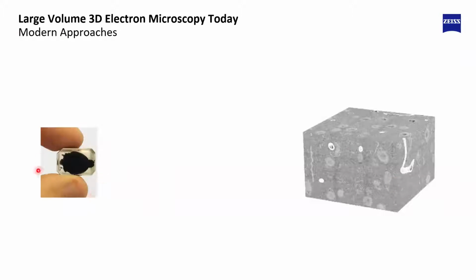What we see on the left is a heavy metal stained brain. That is actually a mouse brain. You might see the olfactory bulb right here in the front. And these are thumbs to give you a little bit of an idea of the scale of how big that sample is. It is very black due to the heavy metal staining. And eventually, this is what we need to create images and actually volumes of data, as you see here on the right. You see blood vessels. These are actually cell bodies of neurons. And you can sometimes see a long stripe that goes from bottom to top. These are actually apical dendrites from the pyramidal cells that I showed in the beginning.